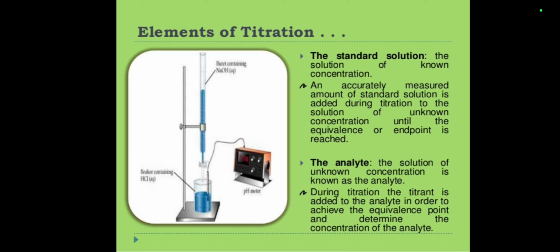That solution is being added to HCl, which is also called the analyte. This is our unknown solution. Okay? So that is the element of titration.